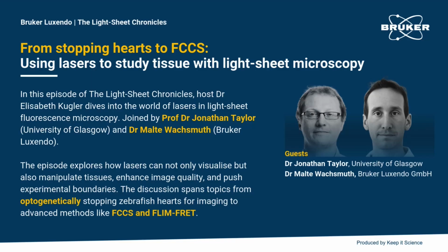Yes, so Malte alluded to what's basically a fundamental limit of physics for a Gaussian beam that says there's this trade-off, in the context of light sheet microscopy, between the Z resolution that we can achieve versus the field of view over which we can achieve that, because our light sheet remains thin and well behaved as we want it to.